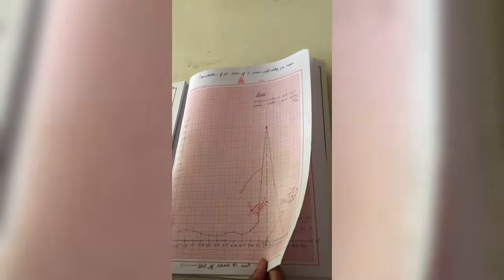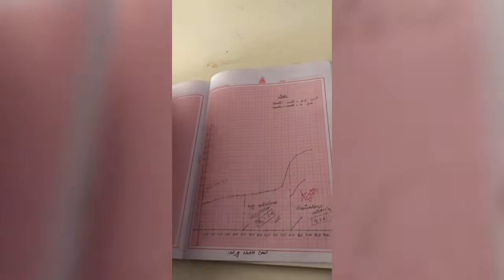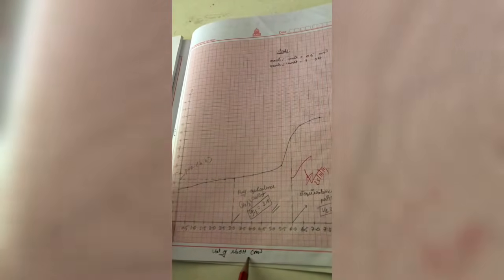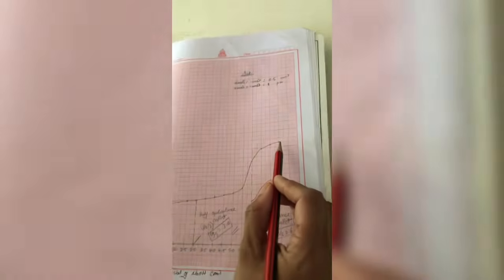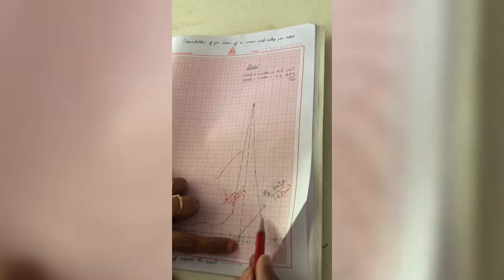Okay, now you are plotting the second graph. Again, taking volume of sodium hydroxide on the x-axis and pH on the y-axis, whatever pH you have noted down here. Indicate all the points and you will get an S-shaped graph like this. From the first graph, you will know the equivalence point. Here the equivalence point is 6.